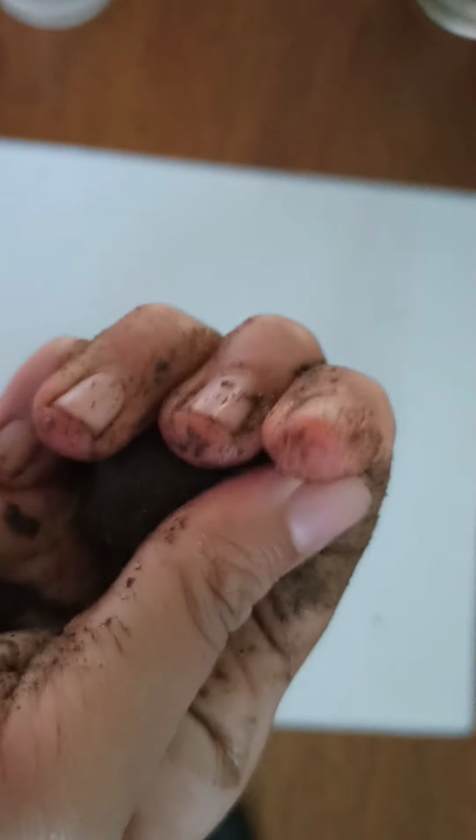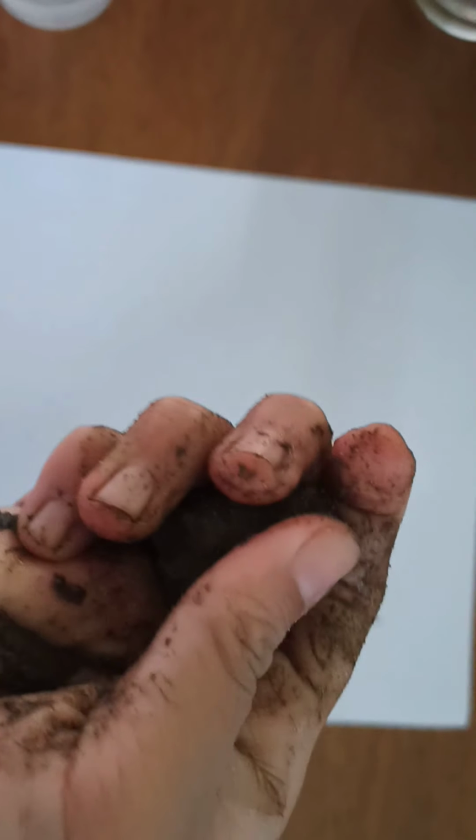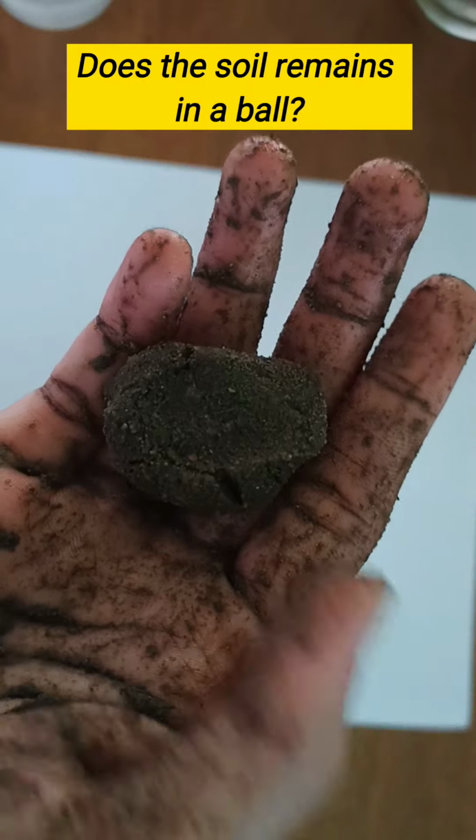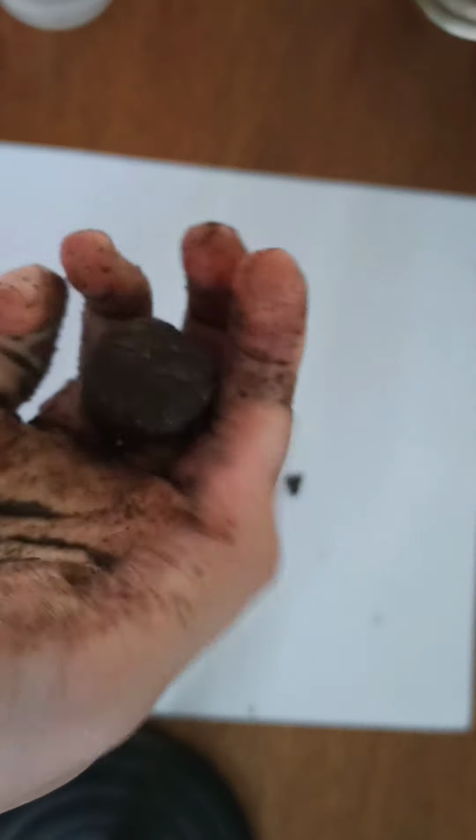Okay, now try to squeeze it. Does the soil remain in the ball? Yes. Okay, so we are going to proceed with step 2.